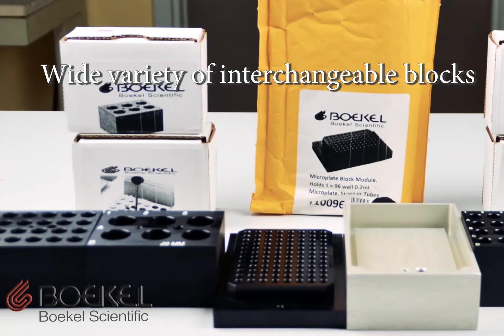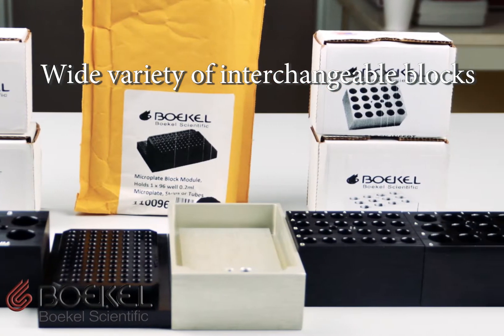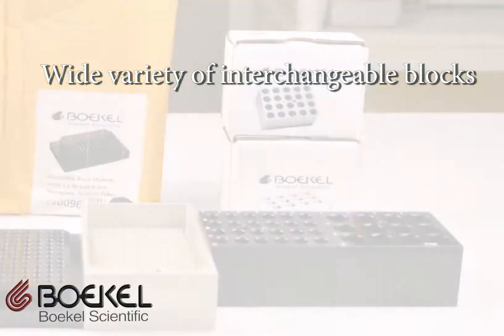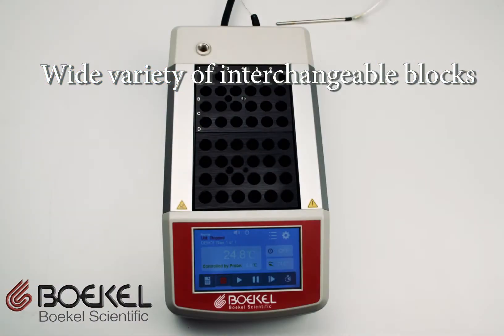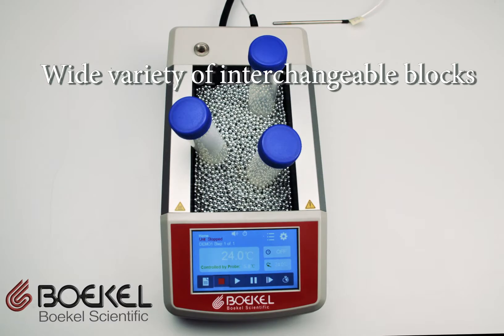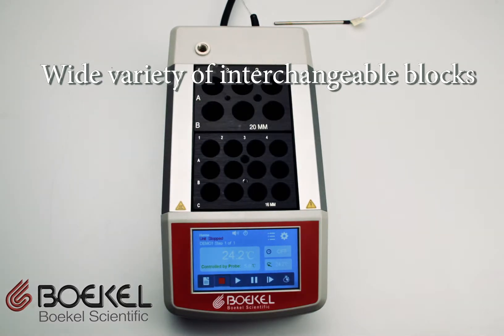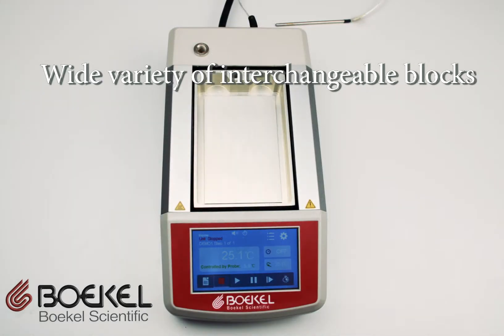Bockel Scientific manufactures a wide variety of interchangeable blocks that are labeled and anodized for corrosion resistance. There are blocks designed for centrifuge tubes to microplates and everything in between. The units are also compatible with heat transfer beads. Contact Bockel Scientific if you require block selection support or custom blocks for your assay.